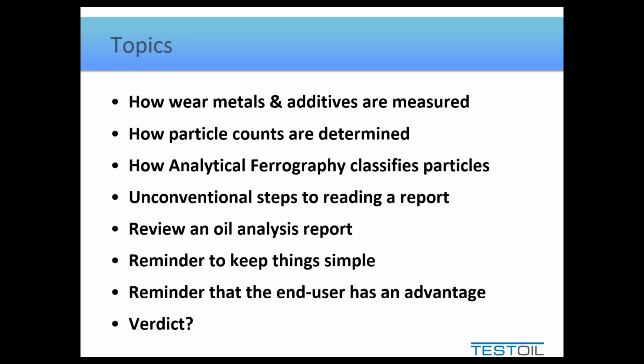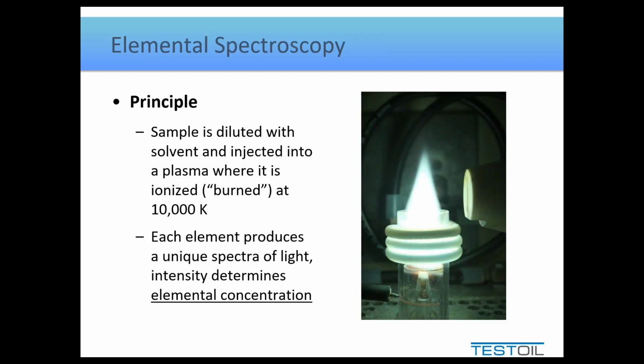So I'll give you a couple of reminders there, and then we'll settle on the actual verdict. At the very end of the presentation, you'll see what went wrong. So to begin, how wear metals are measured. This test is called elemental spectroscopy.